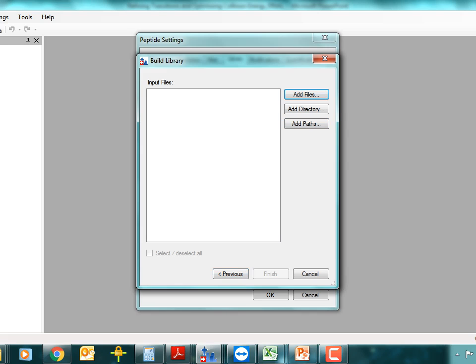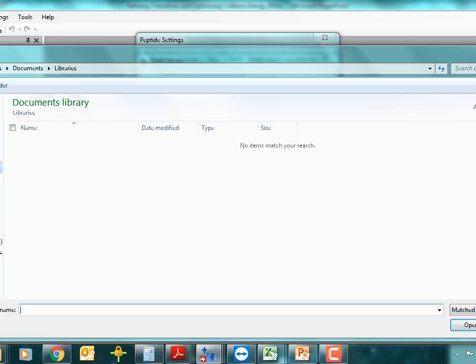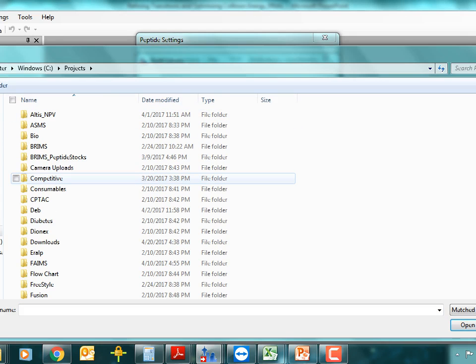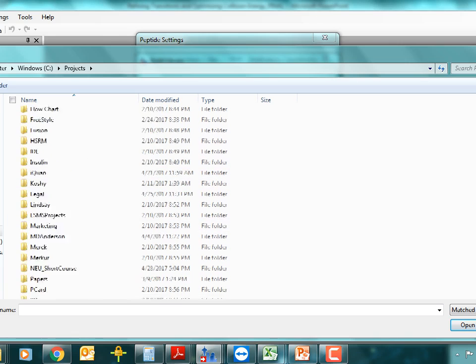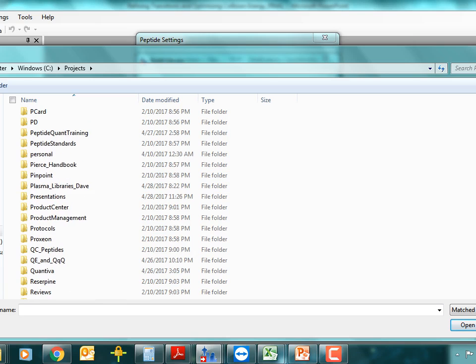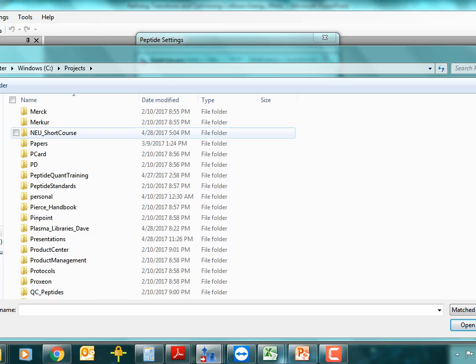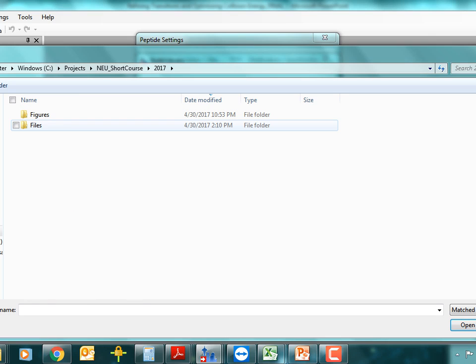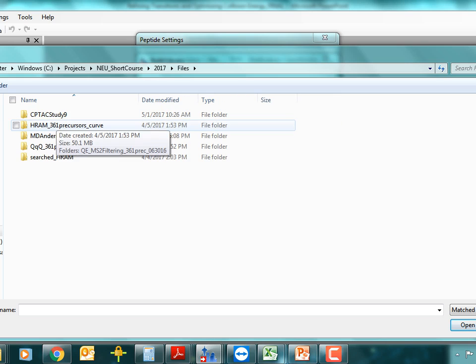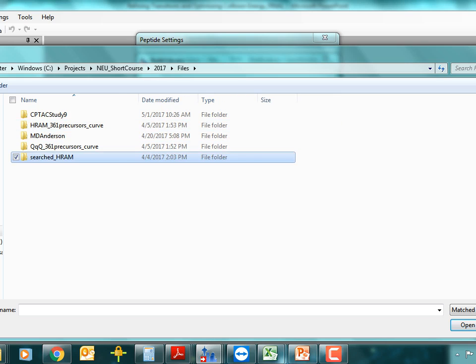Let me go add files. And so normally what you would do is you would find your directory where your searched data files are. And Skyline fortunately looks for specific file extensions, so it can help you find them quickly. Sorry, this should have been searched HRAM.